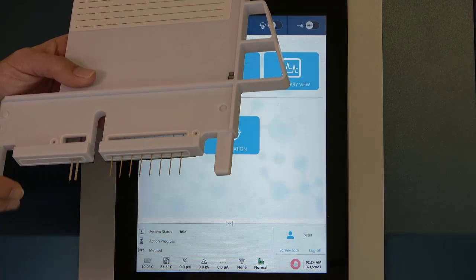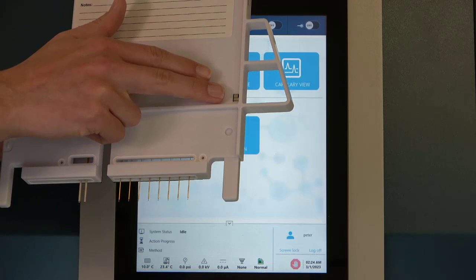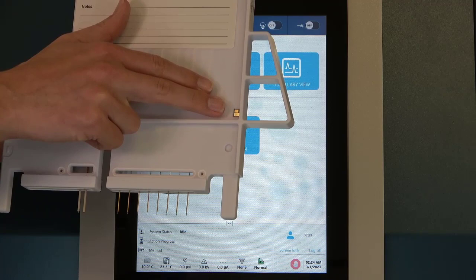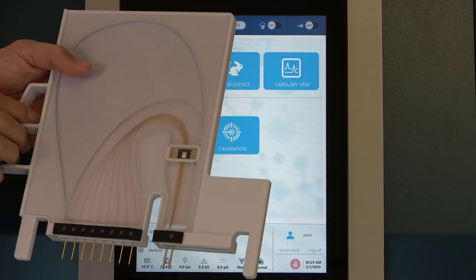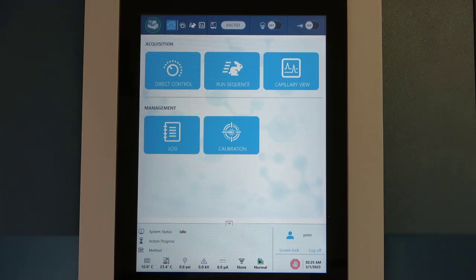The last thing of note is our RFID chip. That RFID chip is going to track the capillary's first run and the amount of runs that have been put across it. There's no upper limit of runs, so as long as that capillary is running well for you, you just keep on using it — but it is nice for traceability. That RFID chip also knows the capillary length and the type of capillary you're using, which will circle back when we get into the method.